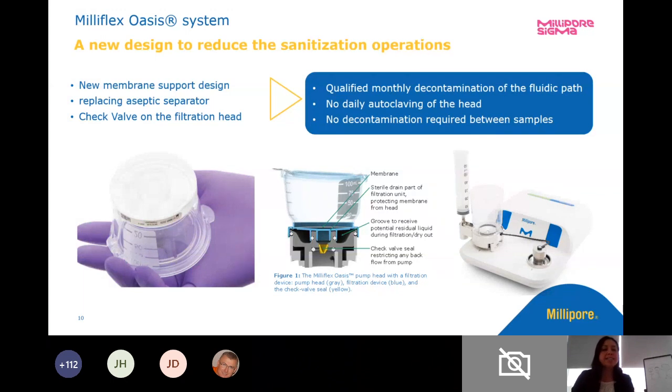As far as the support design of the filtration head, it has a check valve within the filtration head to make sure that fluid only goes downwards towards the drain. There's no way that any fluid can come back up through the membrane.